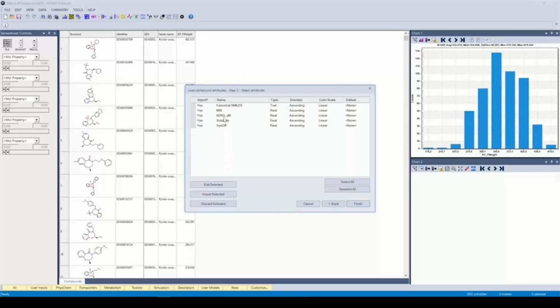And then we have the list of fields that are available to us for import. By default, they're all turned on. So if we proceed, we're going to import everything, which may not be what we want to do. You can actually selectively import. If you have 20 or 30 fields that come along from that Excel file, you may not want to bring in that many fields.